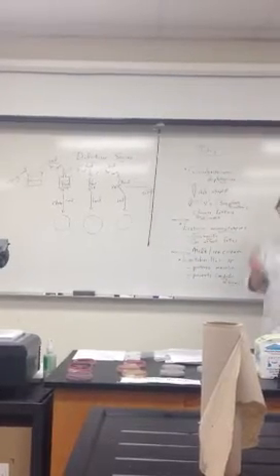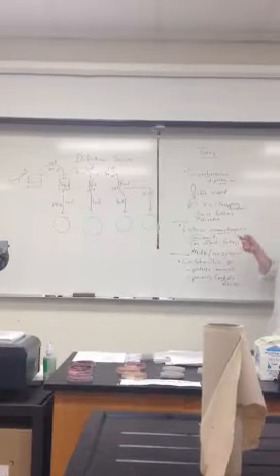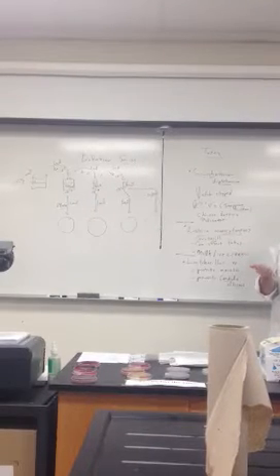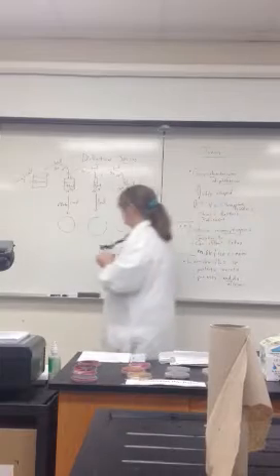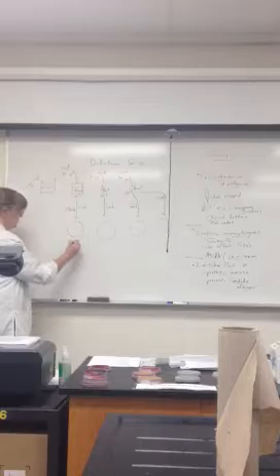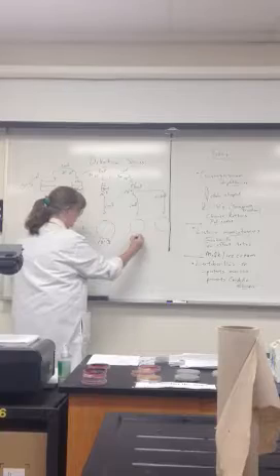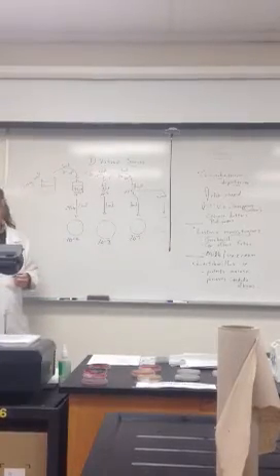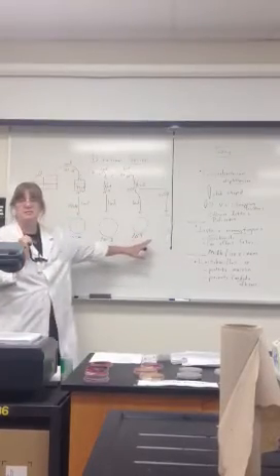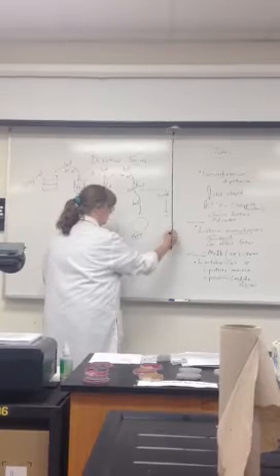If you plate a tenth of a mil, which is 10 times less than 1, what is going to increase on your plate? Your dilution. You might have fewer organisms. So if you're going to talk about the plates, this matches 10 to the minus 2, 10 to the minus 3, still matches 10 to the minus 4. What is that? 10 to the minus 4. 5. 10 to the minus 5. Oh, okay. 10 to the minus 5, because you're plating less. Okay, 10 to the minus 5.